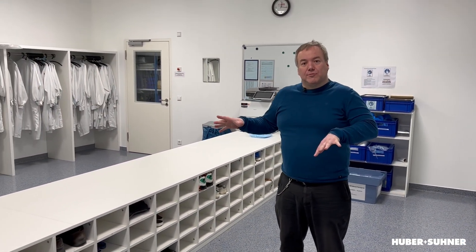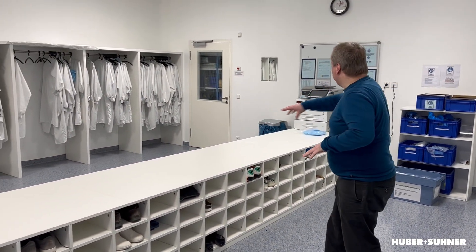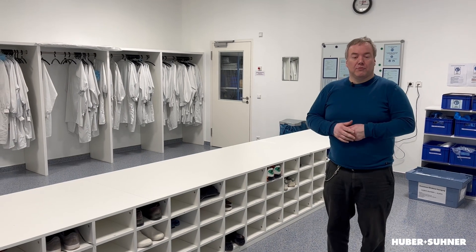First of all, let me explain what you can see here. This is our air lock and it has two sides which are divided by this sit-over bench which goes completely through the room. This is the dirty side — you can enter it with your normal clothing and your normal shoes. And this is the clean side where you need special clothing.